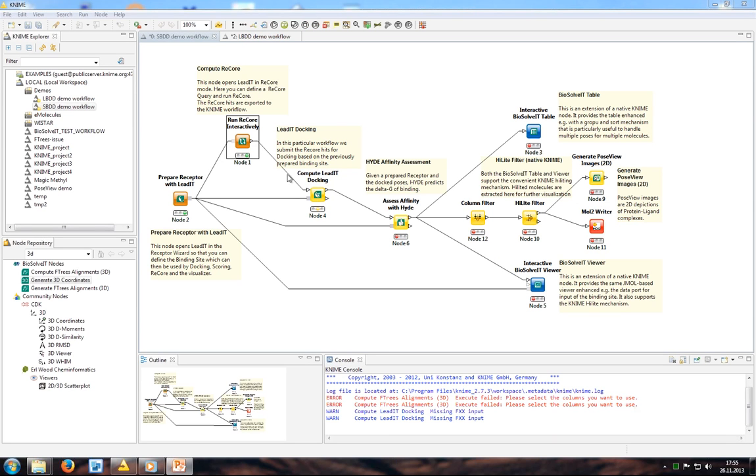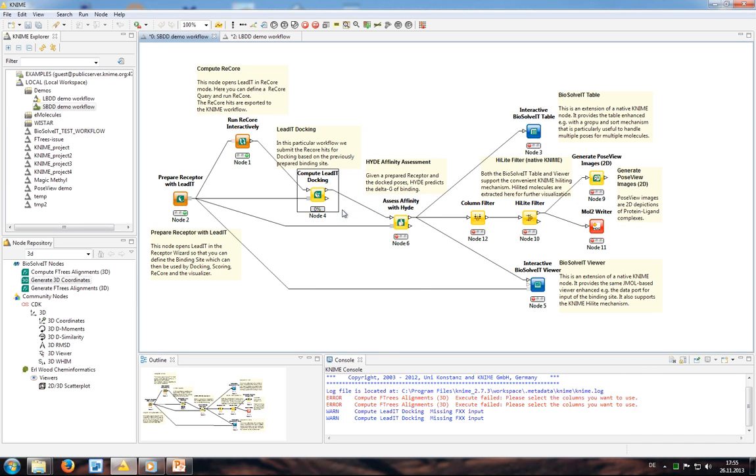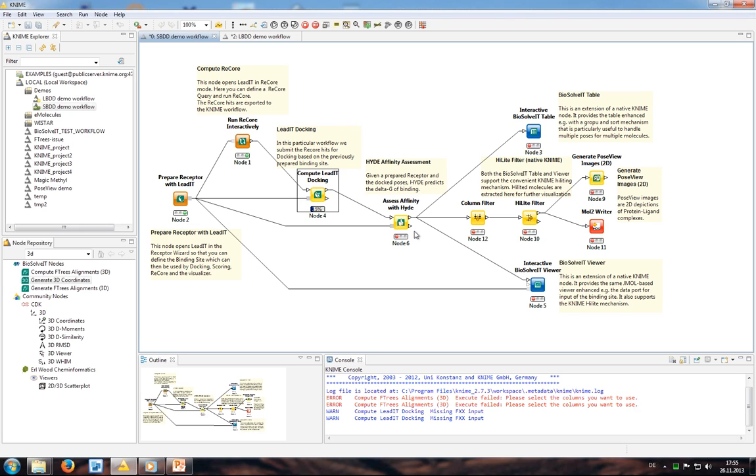Wow, this is largely protruding into the active site. Well, this is no wonder since we haven't told the program to take the protein into account. It is under the advanced options here where you have a shape tab and can use the binding site atoms as excluded volumes. If I now run ReCore again I get only much smaller solutions back that fit into the active site without protruding into the protein. I leave LeadIT, exit and return to KNIME, save the changes.